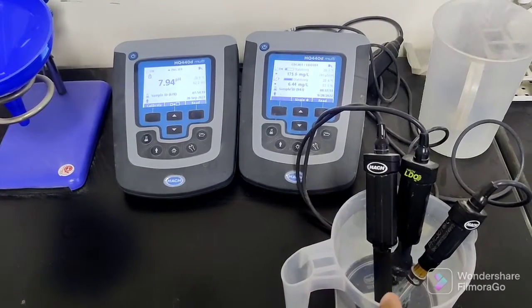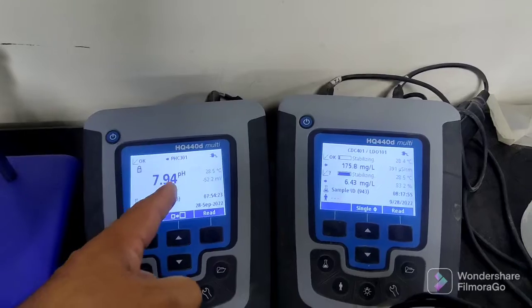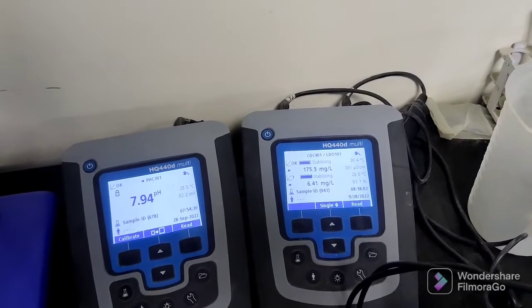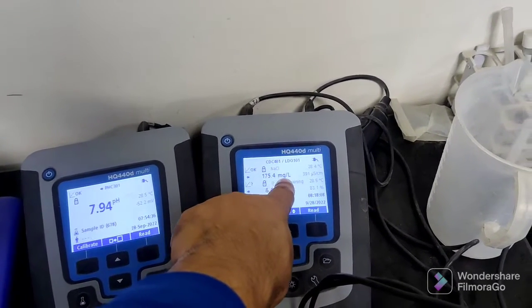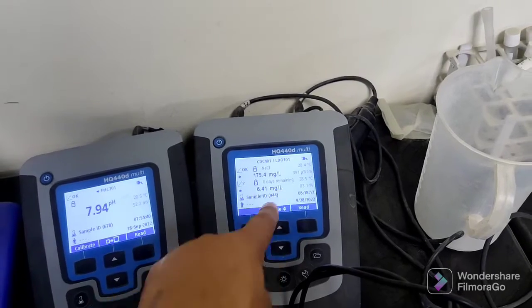So for clean water, the pH reading is 7.94 — that's very good. Now we are checking the conductivity and the DO — DO means dissolved oxygen. You can see here 175.4 milligrams per liter, and 6.41 milligrams per liter.